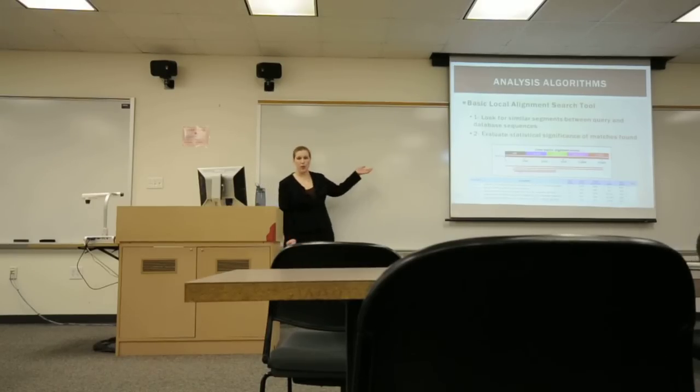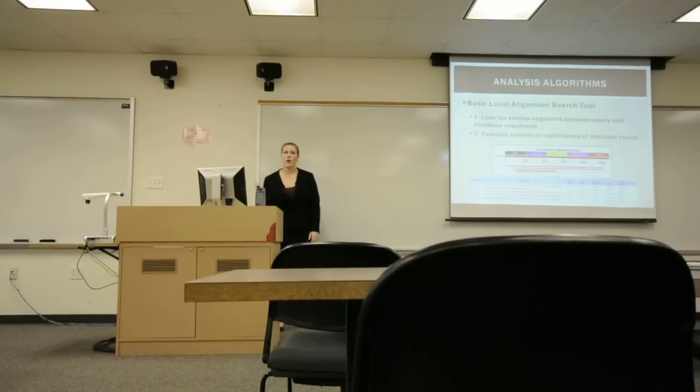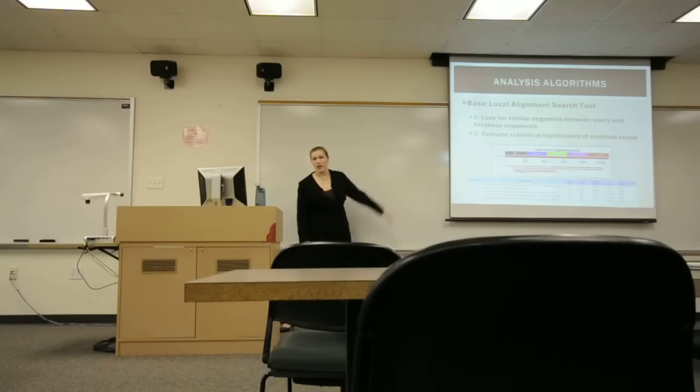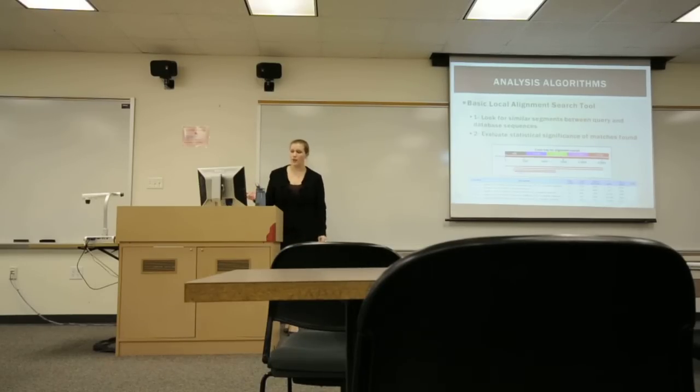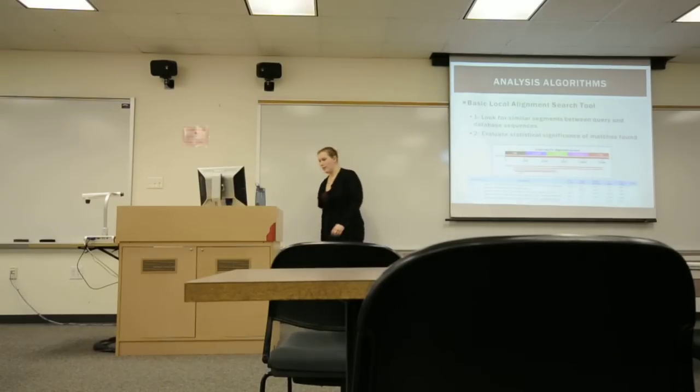Here's an example of the output. The top line is red, which represents the highest quality match. It's also almost as long as the query, so you can tell that this is a really good match. It has almost 100% query coverage. The bottom match, you can barely see, it's the little pink line. You can see this is a lower scoring match, and it also covers way, way less of the query. And again, back to the e-values, BLAST provides the e-values down there in the table.